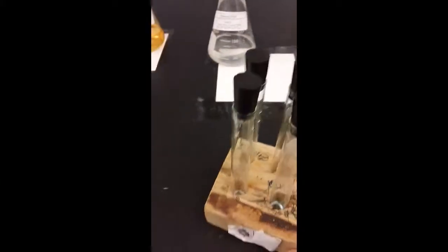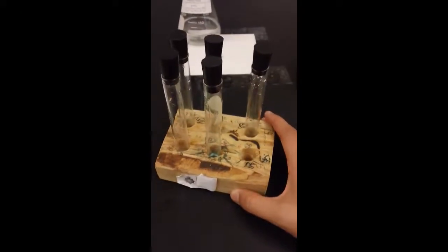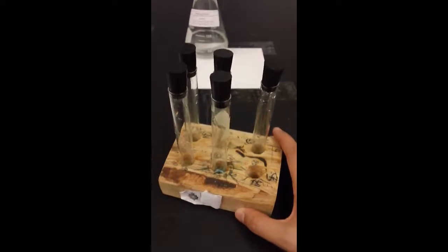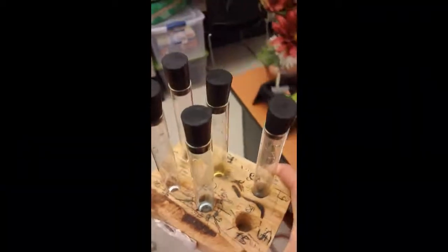All right, so now that I have my base, these are my 5 known chemicals, I know what each of them are, I'm going to go run test A on each of these chemicals and record down what I see. So when I run these tests, you need to write down in your notebook what you see. Let me go grab my lighter. Okay, so now I have my lighter.